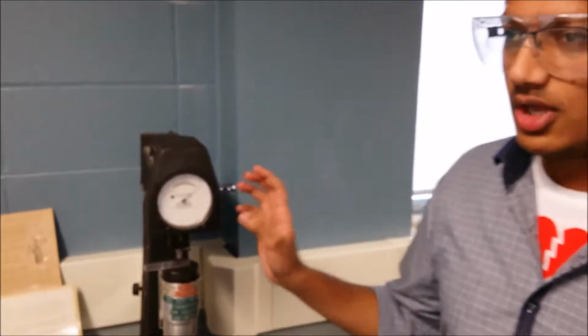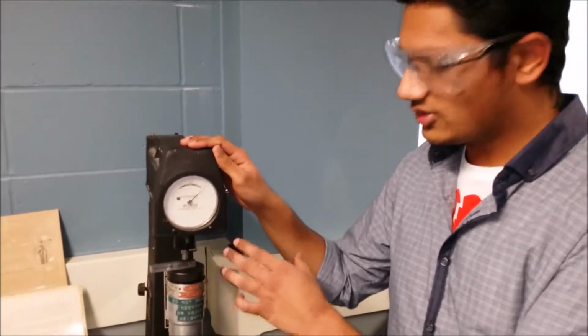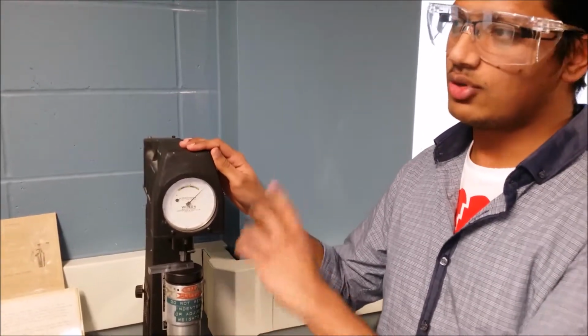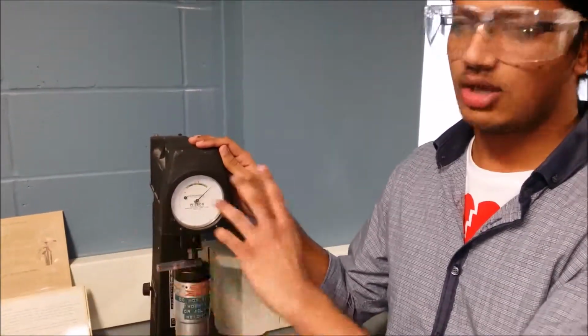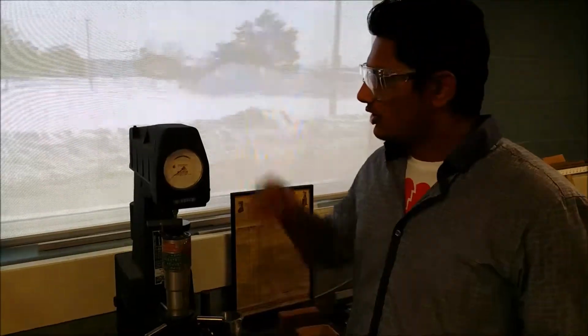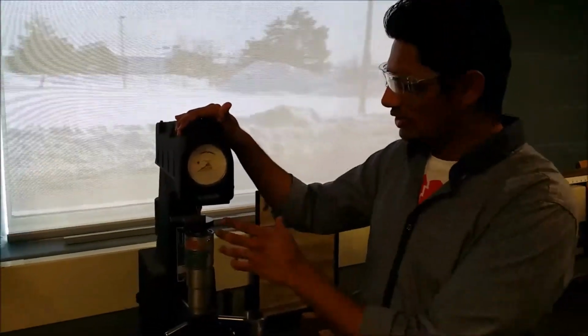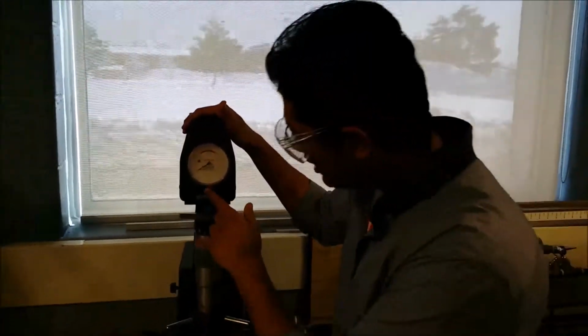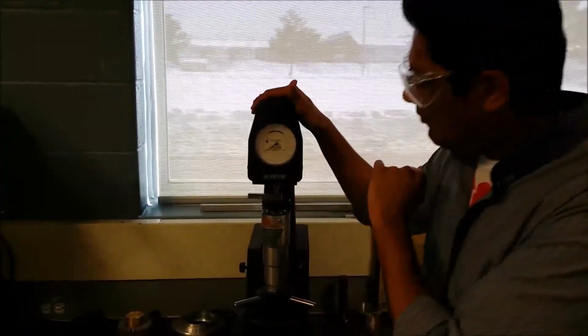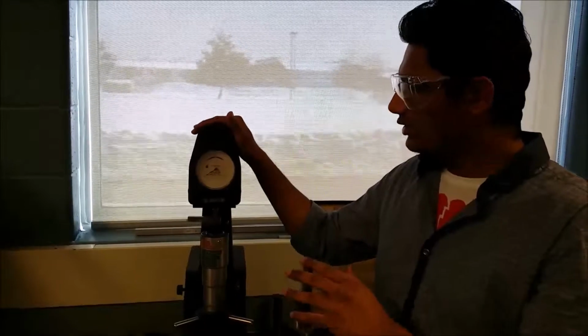So the result that we got here is less than 10, which tells us that this material is softer. So for that we have to go to the B machine and check the hardness of this material. This is our B machine, and it has the same setup as the C machine. We did the test on this, and the result we got is 96 or 97 on the B scale.